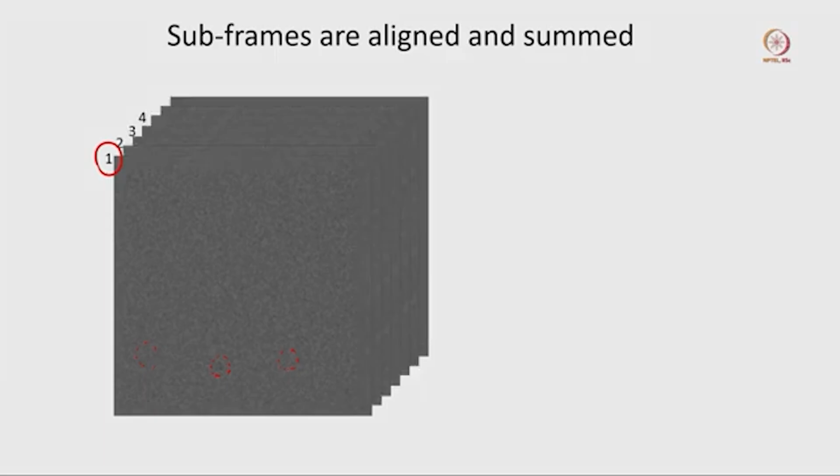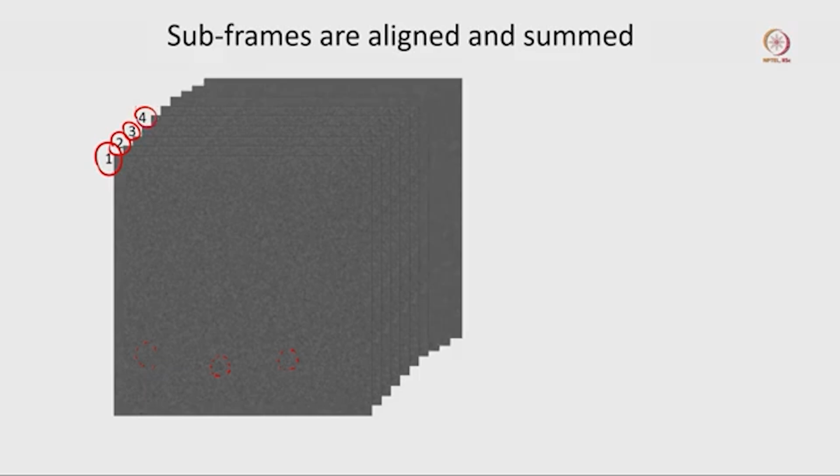So, here I am showing you some of those frames. I collected a couple of frames here. You can consider this frame number 1. In this particular image we cannot see anything clearly. There are maybe some spots here, something visible here, something visible here, but it is not very clear at this moment. Next, as I mentioned, we collect more frames and keep going like that.